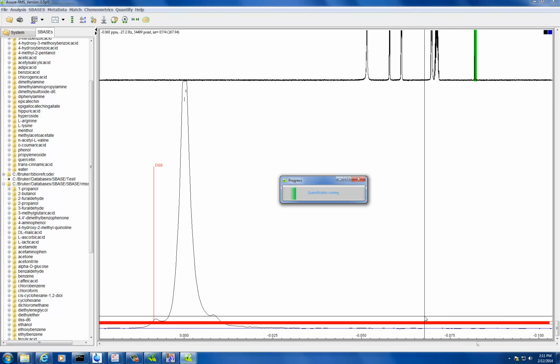Okay. Can you just show one of those? Yeah, for sure, we can do it for that. The only thing is, again, I don't know how many protons are there, so you're going to have to figure that out. So we'll do one. Okay.